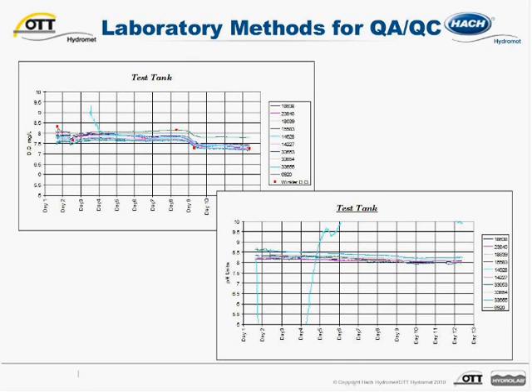In the lower right hand section are pH data from the same lab tank test. Wild fluctuations in this parameter may be an indication of poor maintenance or sensor malfunction.